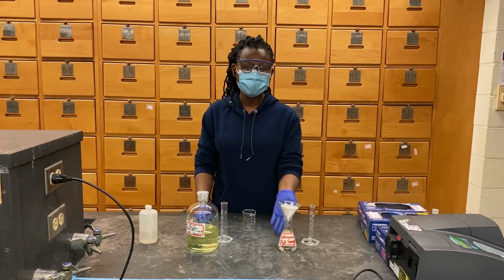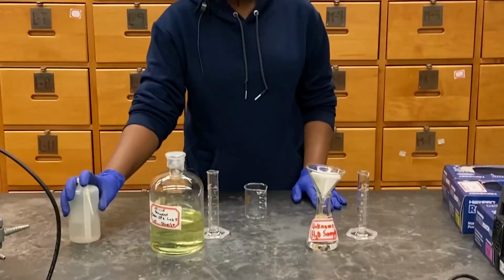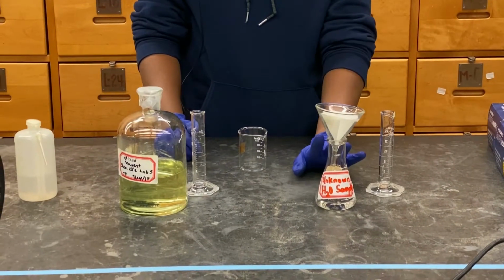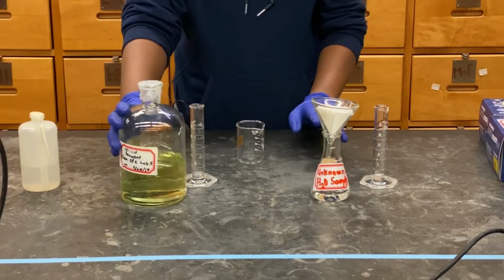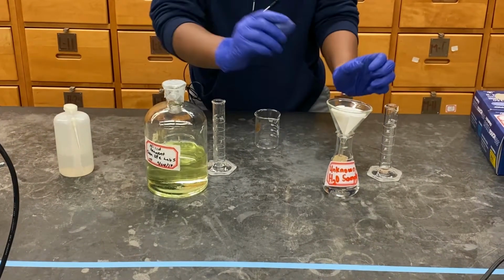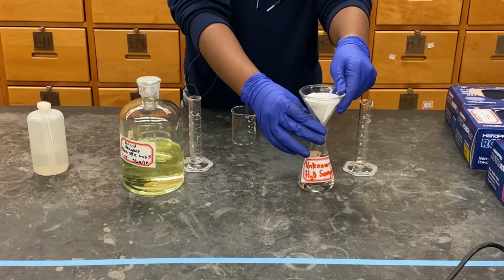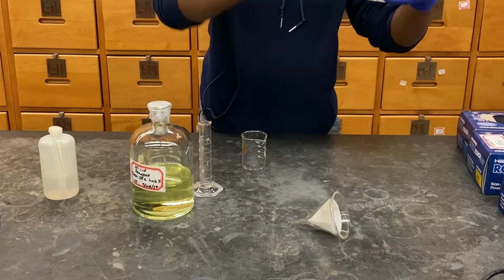Unknown water sample here. I have my mixed reagents and I have my DI water here. So I'm going to be using 5 mL of the unknown, 5 mL of the mixed reagents, and 15 mL of the DI water. This unknown water sample has been filtered already. 5 mL.